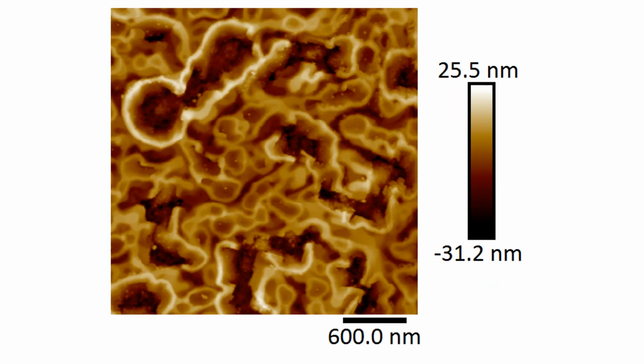So here is a different crystal structure. Scale bar again at the bottom of the screen showing that that represents 600 nanometers. So we're looking again at the height, otherwise known as the topography, of a crystalline structure grown on a substrate here by a group at Towson in the physics department.